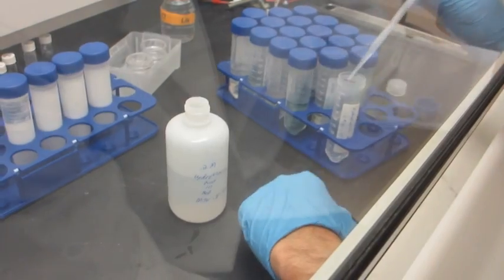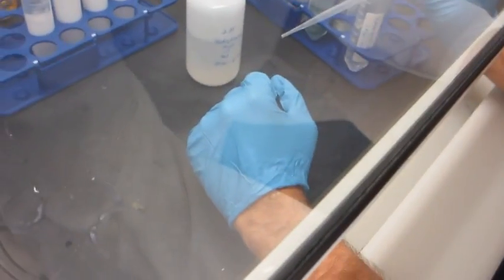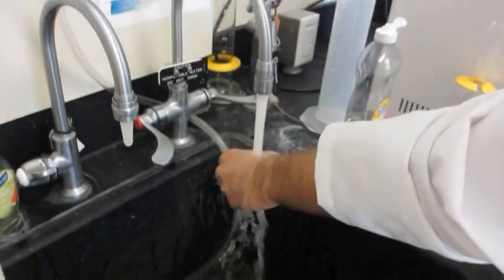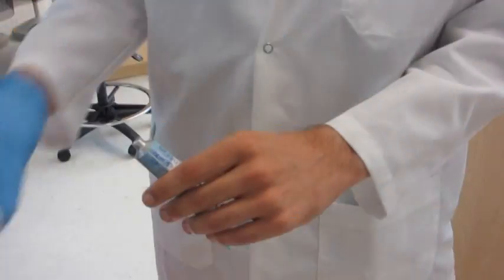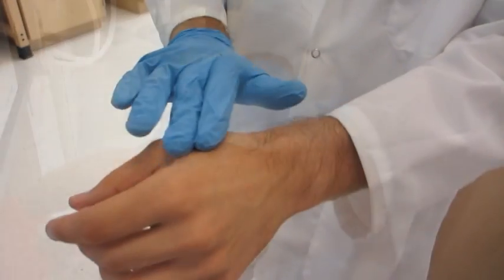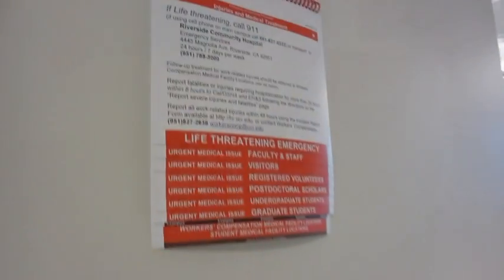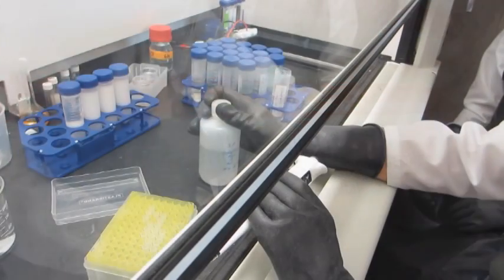In case of emergencies, have a buddy call 911 and stay on the phone for instructions. If you accidentally spill hydrofluoric acid on your skin, immediately flush the affected area with water for at least 15 minutes. Then apply calcium gluconate gel to the burned skin only, massaging it into the affected area. If you accidentally splash hydrofluoric acid on your eyes, use an eyewash for at least 15 minutes. Then follow campus procedures for injuries and medical treatment, and always report the injury to a supervisor.